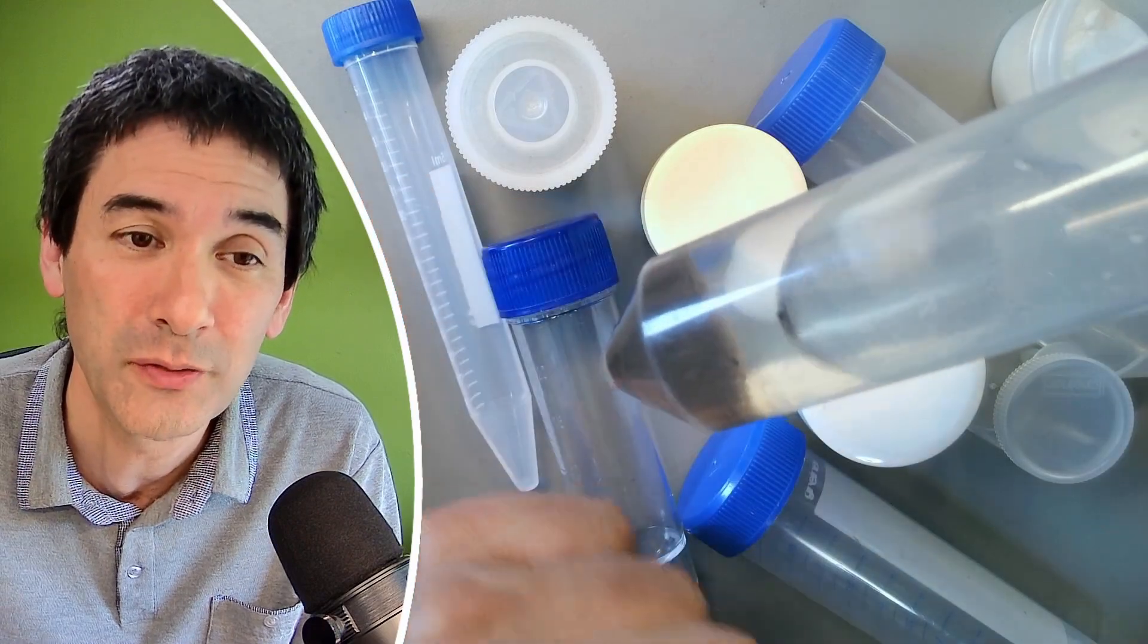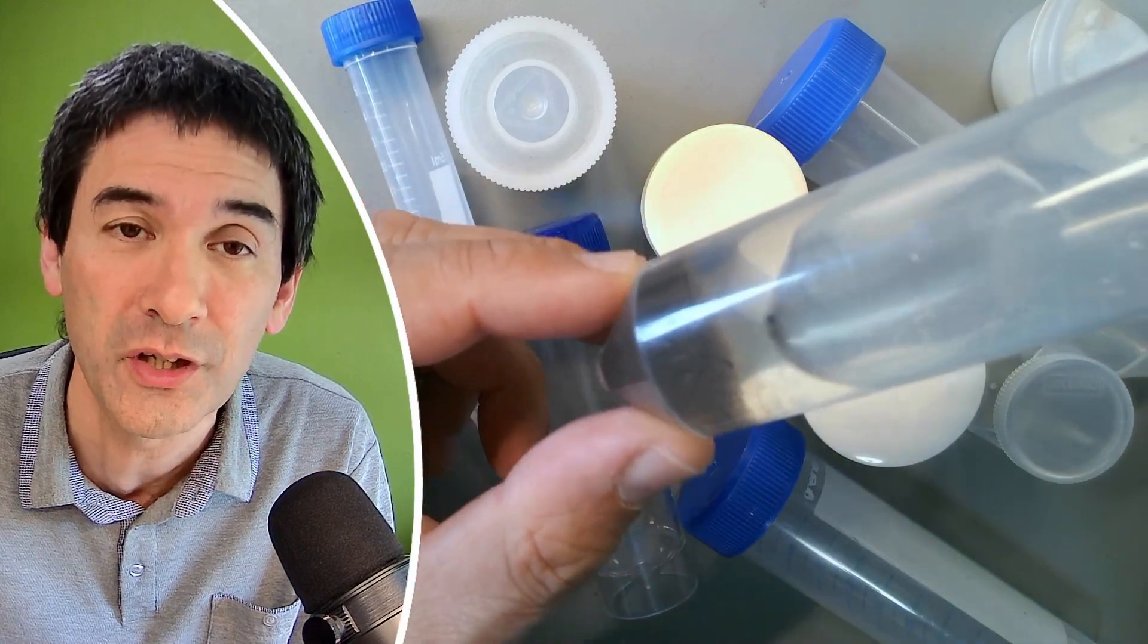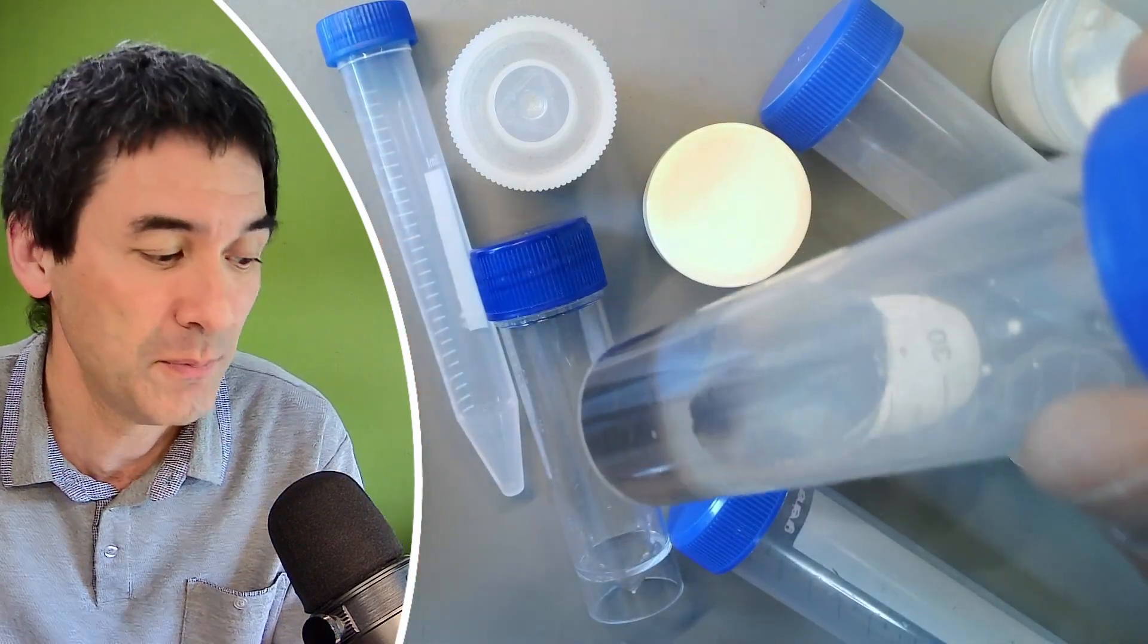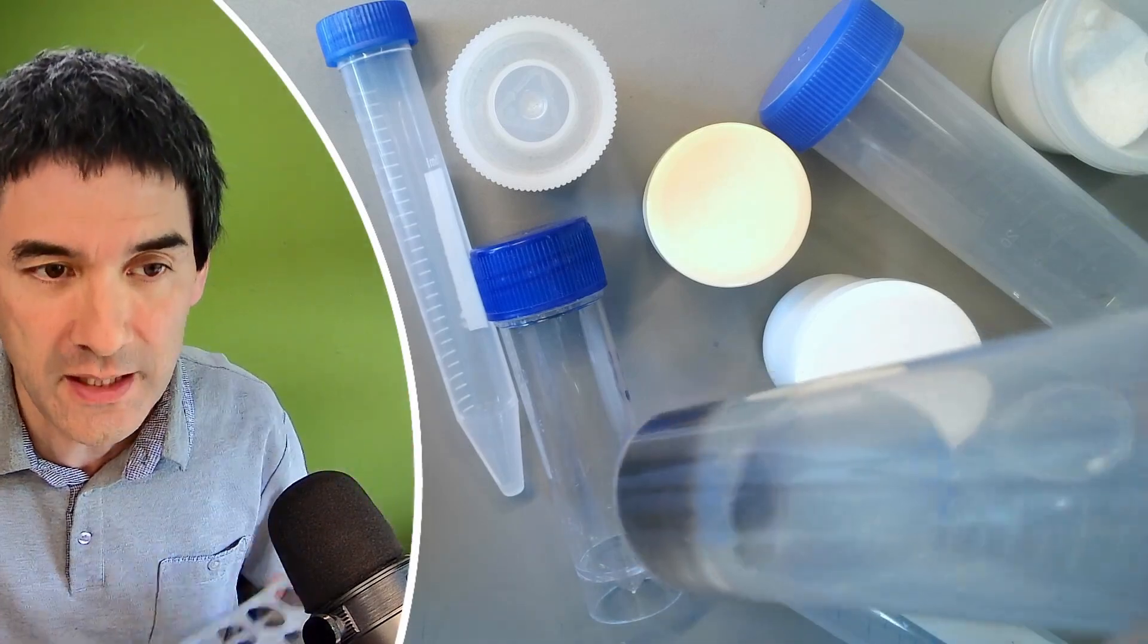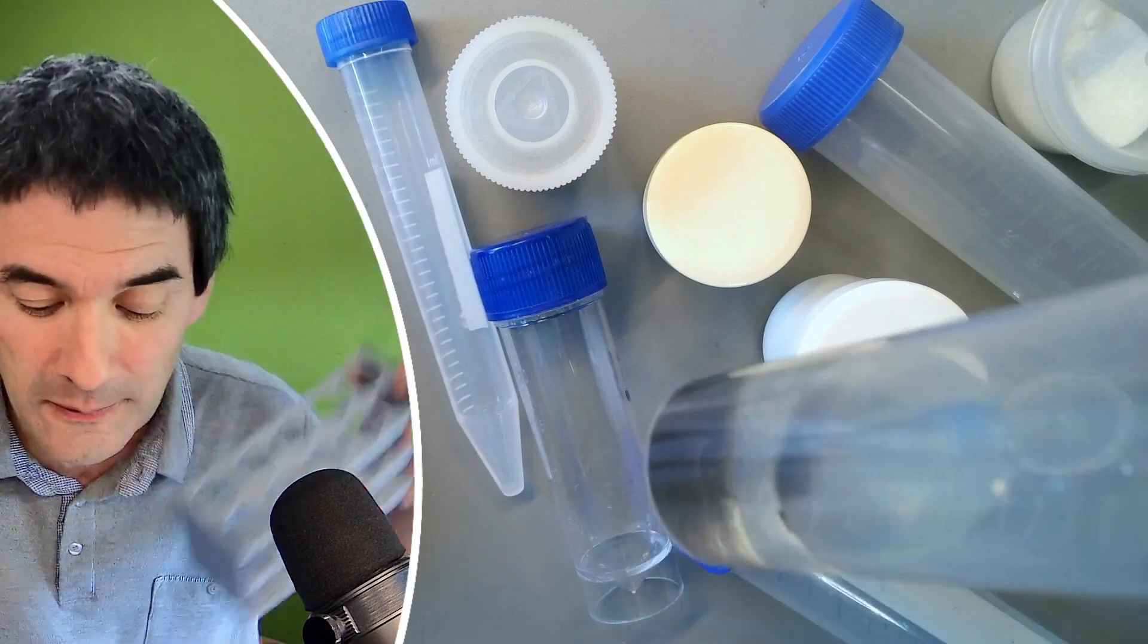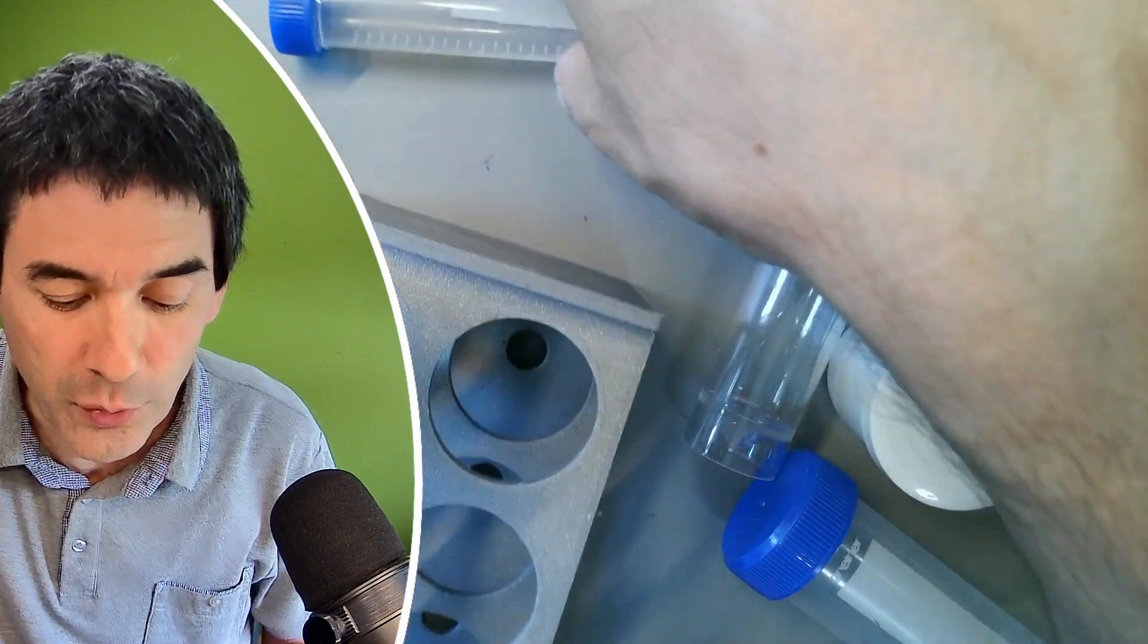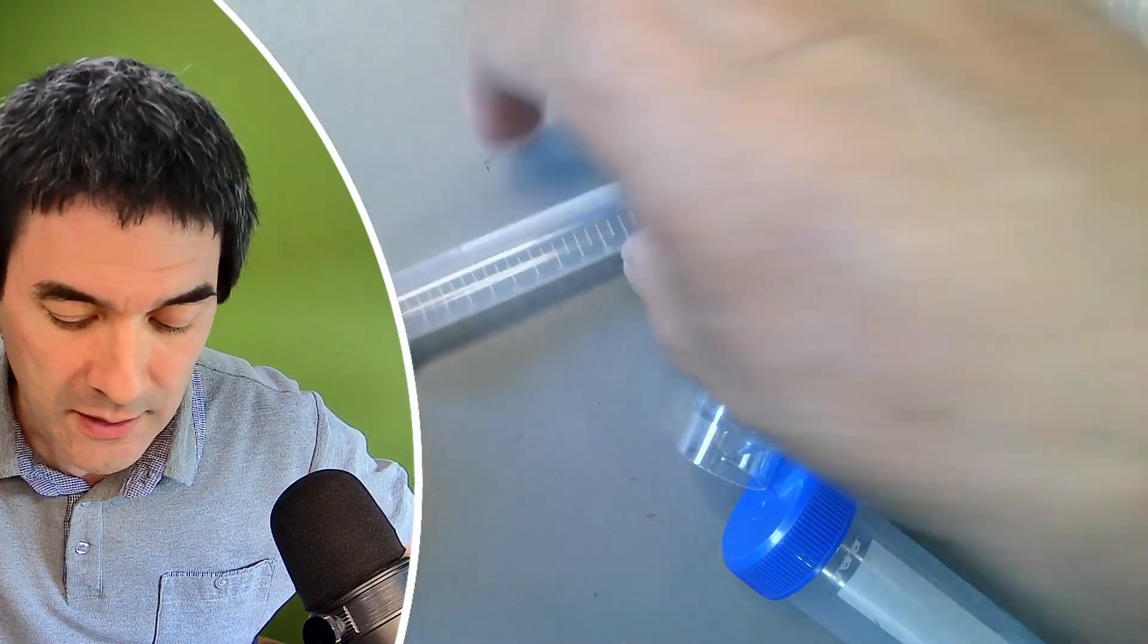Just by looking at it you're probably already going to see a major disadvantage and that is it's kind of conical over here so there is no possibility to actually stand it up here. So what I've made is the following I 3D printed myself a rack here where you can actually put in those tubes.